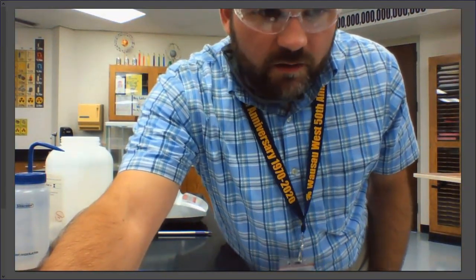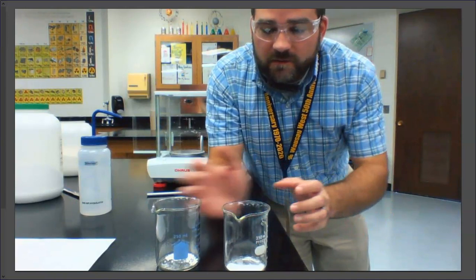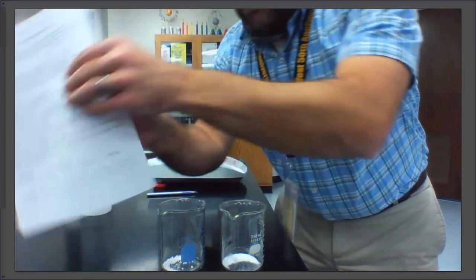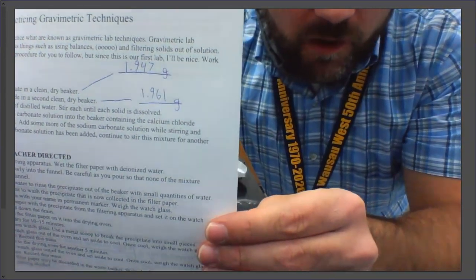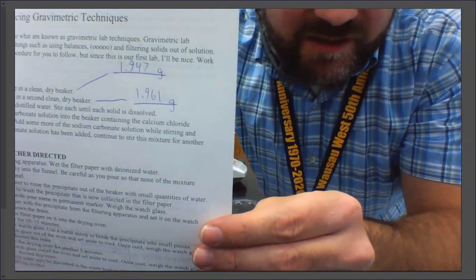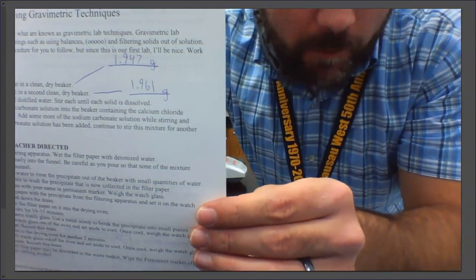I'm going to mass out the calcium chloride, the other reactant that we have, and then I'll come back in just a little bit. All right, so I have now massed out the calcium chloride as well, and I have about 2 grams of each of my powders in these beakers. I would like you to also record the mass of the calcium chloride that I've added, okay? So I have 1.947 grams of sodium carbonate and 1.961 grams of calcium chloride. We're going to need those later for some problems, okay?